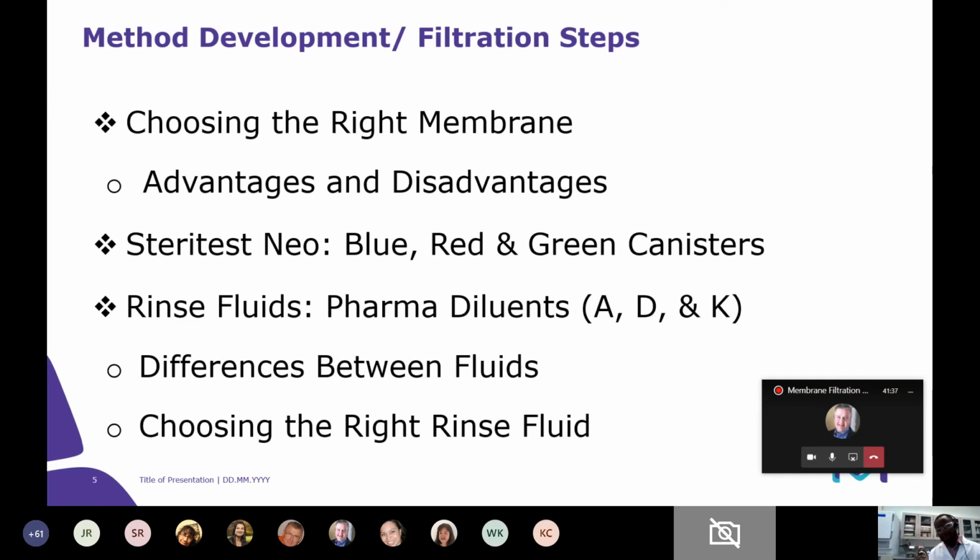Another challenge arises from that. If you have to use an isolator, one of the challenges is, how do we warm it? Because you're going to have to run a sterilization cycle in the isolator. So if you're going to be testing in an isolator, from the get-go, make arrangements to have something in there, a warm plate or hot plate, that will help you warm your IPMs, if possible. Validate with it.